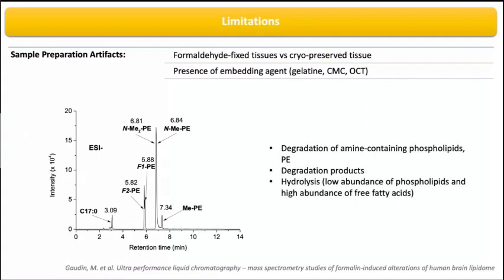So what is this fixing of the tissue? It's using specific fixators like formaldehyde, a step that is very commonly used in microscopy or histology, but it counteracts when we use these preparations in mass spectrometry, because using fixators such as formaldehyde might produce degradation products.